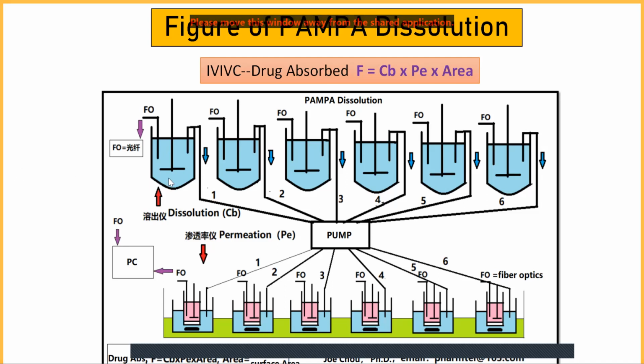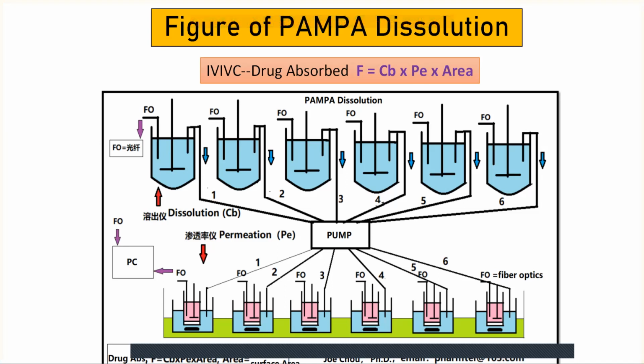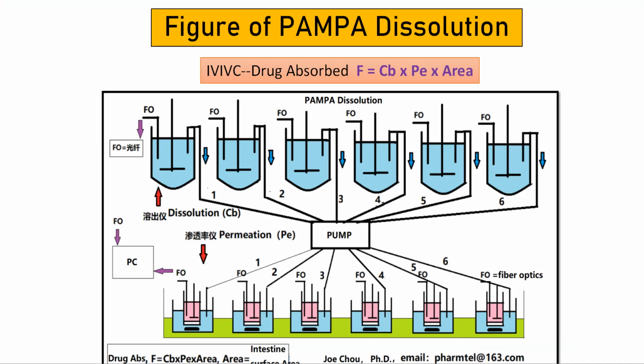Initially we use roughly 400 ml of gastric fluid, and that lasts for 30 minutes.